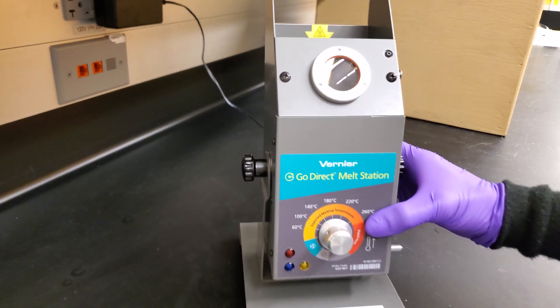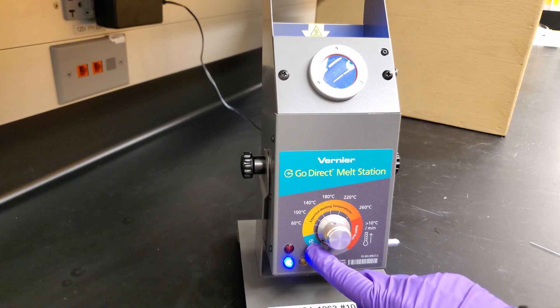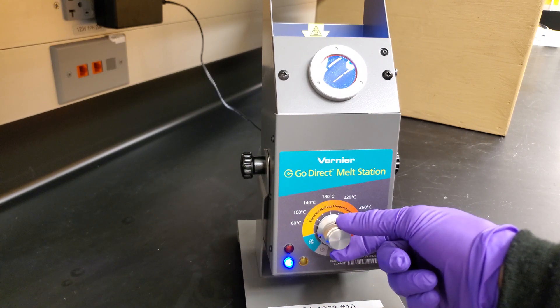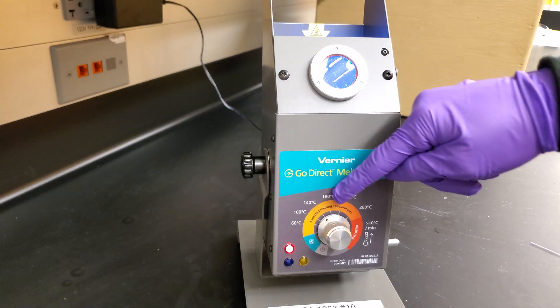You turn on the device by giving it a gentle turn. We're currently in cooling mode with the fan running, so the blue light is on. Now our red light is on as we get into the heating area.